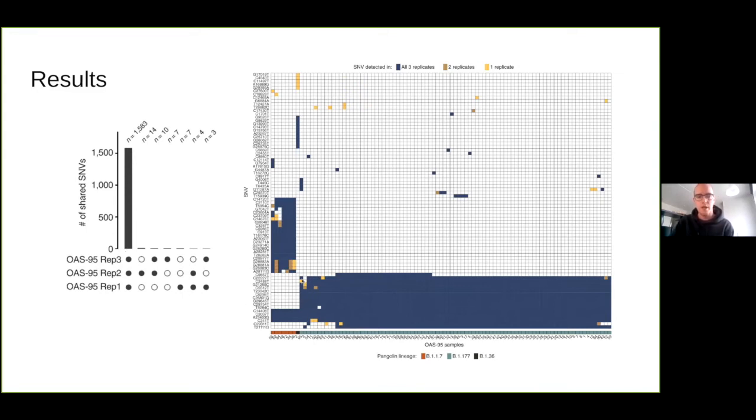And here's the heat map showing basically all these SNVs. And you can clearly see 2 kind of clusters. Here on the right is a cluster with all these mutations at these locations in the SARS-CoV-2 genome. And this cluster was basically the SARS-CoV-2 variant that was going over all of Europe, kind of the main variant, so to speak.